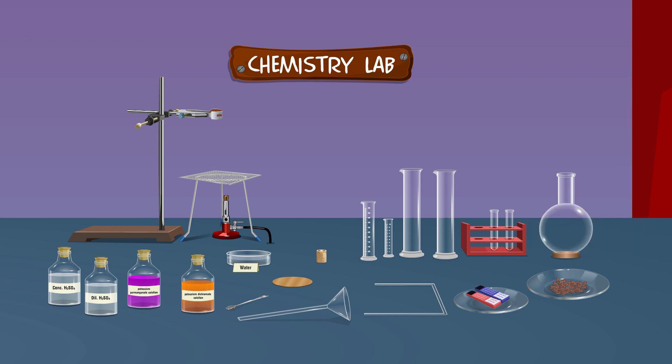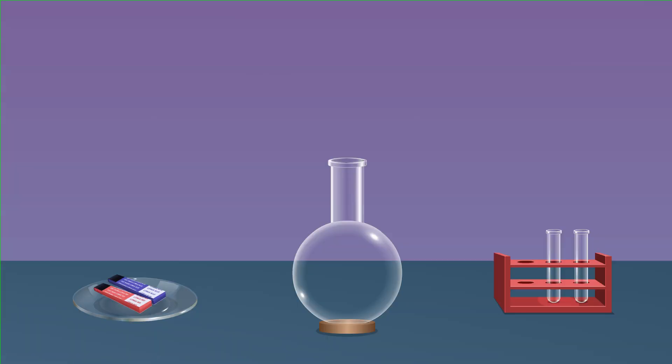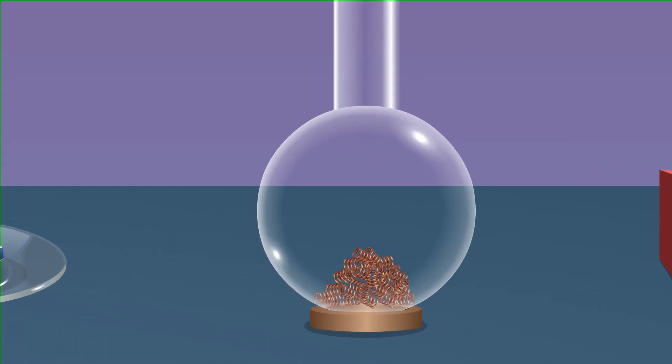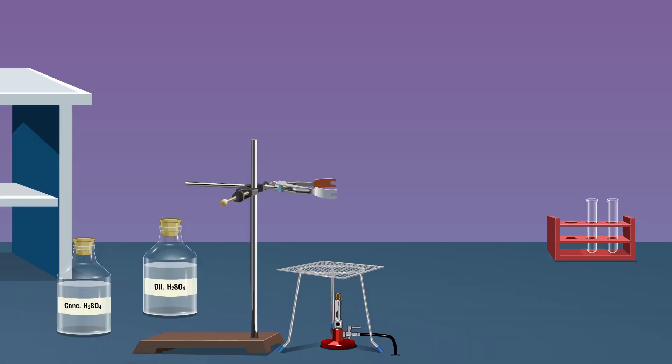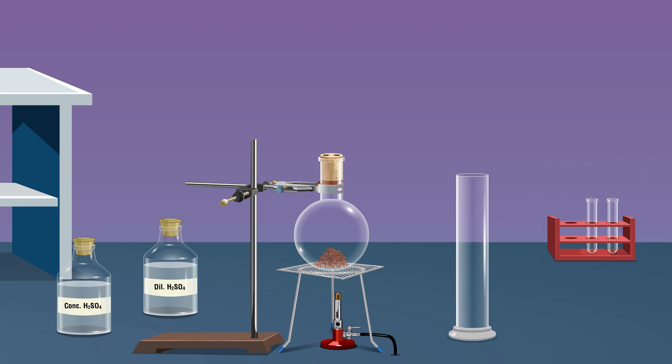Take a round bottom flask and add a few pieces of copper turnings — about five grams — using a spatula. Clamp the round bottom flask as shown. Place the tripod stand and burner as shown. Place a double board cork on the mouth of the round bottom flask. Place the gas jar near the tripod stand. Insert a delivery tube into one hole of the cork and insert the other end of the delivery tube into the gas jar. Then insert the thistle funnel through another hole in the cork.